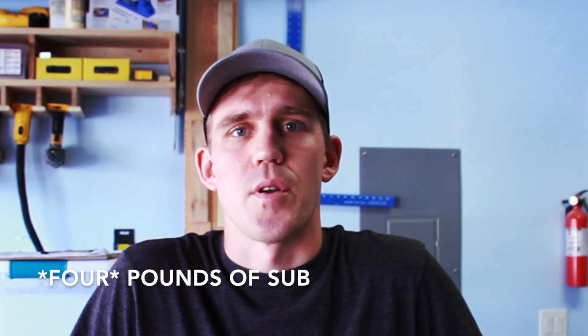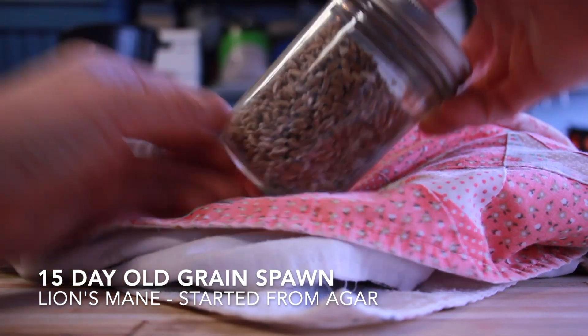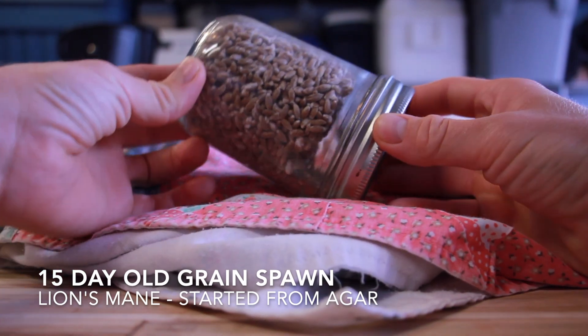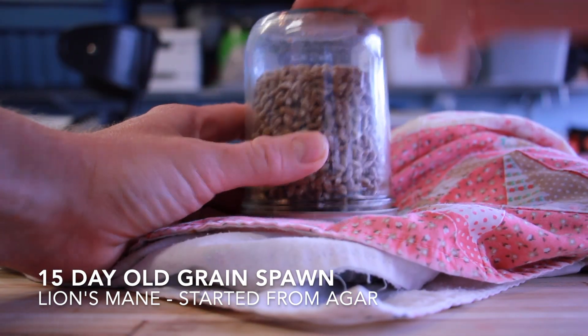Just a quick video to show you how I did it - let me know if you see something I messed up or something I could do better, always open to suggestions and better ways to do it. I started out with this jar of rye grain that I had transferred a wedge of agar onto.